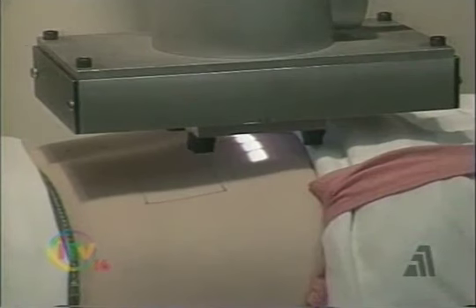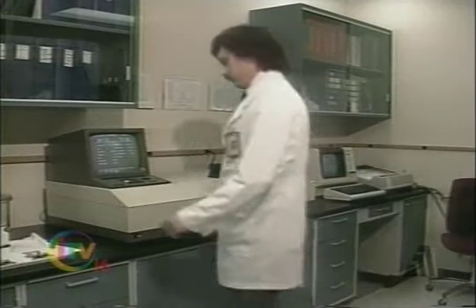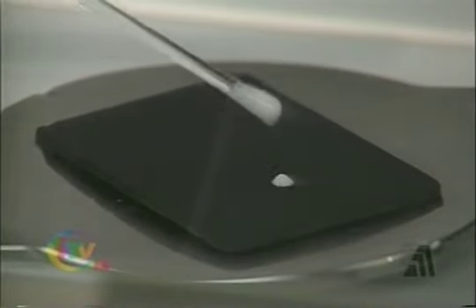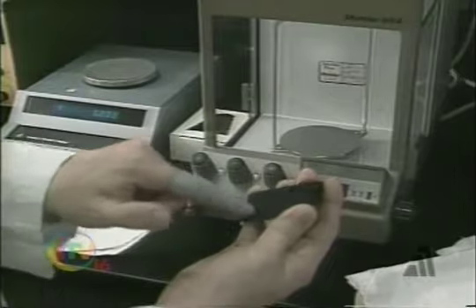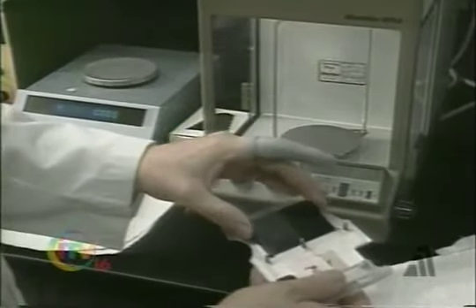Plough tests its products extensively to see how long they stay on in the water and how well they absorb ultraviolet radiation. The most accurate way to measure ultraviolet absorption is with spectroscopy. A carefully measured amount of sunscreen is first smeared onto a rectangular block made of protein. The protein chemically simulates human skin, and the thin layer represents a typical application of sunscreen on it.